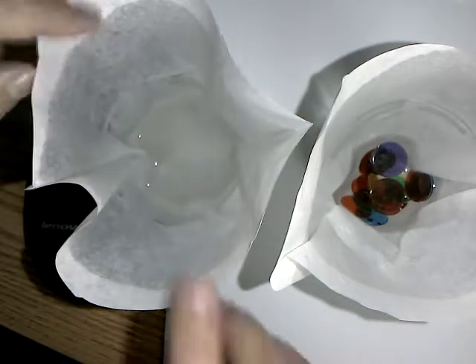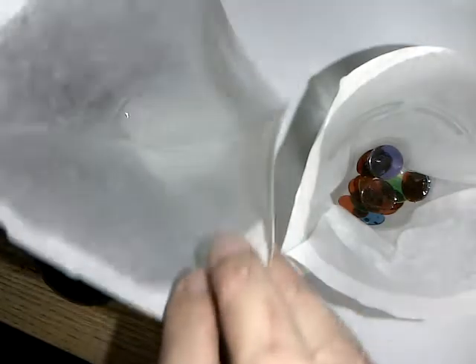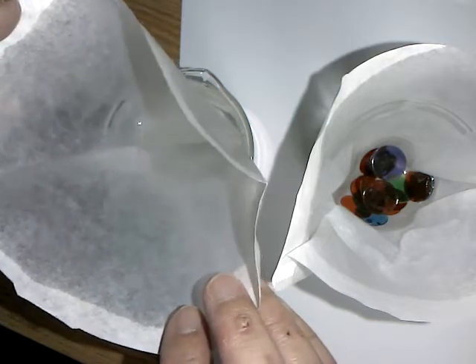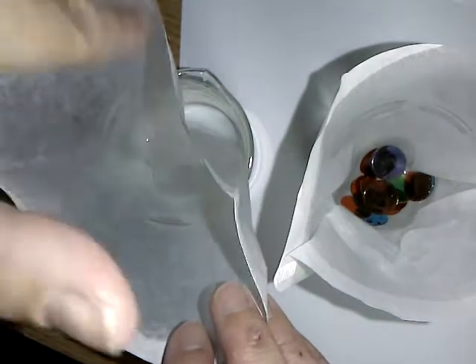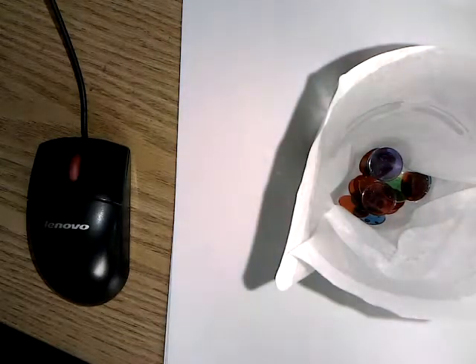One observation that you might be able to see is that all of the water in this filter is able to go through that beaker. Okay, it is called permeable. Permeable means that all substances that are in this membrane are able to go through. Okay, permeable. So I'm going to show you again so you can see.